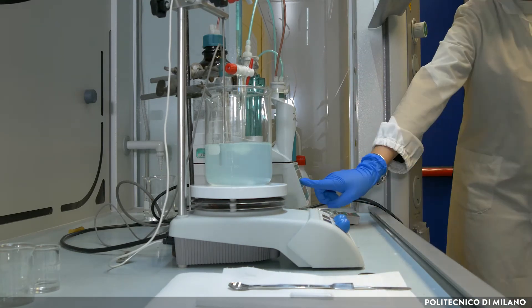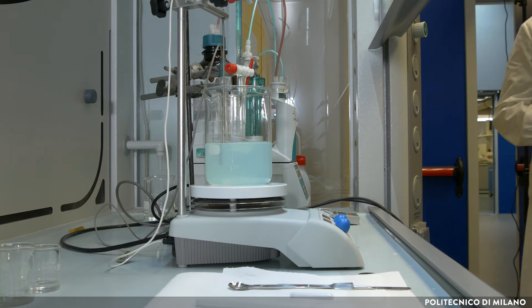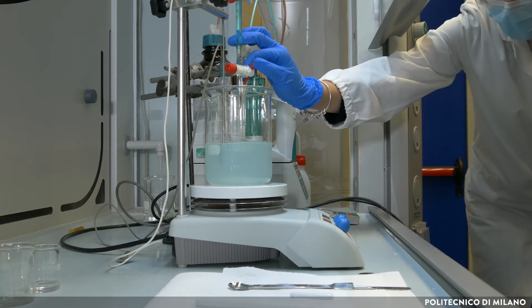When all the salt solution has been added, the system is left under stirring overnight to complete the precipitation process. This step is called maturation time.